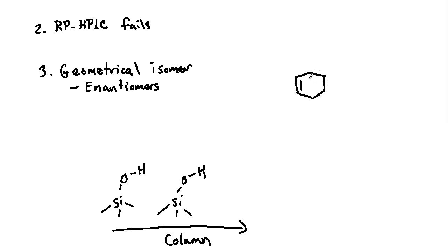So for one, we are going to have a para-dichlorobenzene right there. Okay, so para is a 1,4 positioning like this. Okay, and we're also going to consider its geometrical isomer, which will be the meta version. So here's chlorine and here's chlorine, right? So this has a 1,4 substitution pattern, whereas this has a 1,3 substitution pattern.